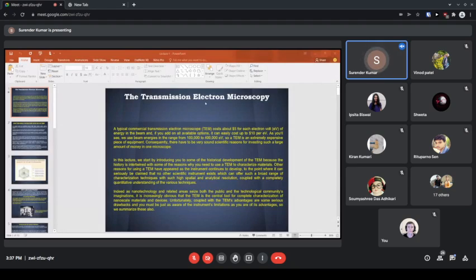And this signal, the physical direction of the signal is not like that. It is just for remembrance, the different signals generated. It's not like on the backside you have only secondary electrons. So it is not the case. The direction shown for each signal does not always represent the physical direction of the signal, but it indicates it in a relative way.